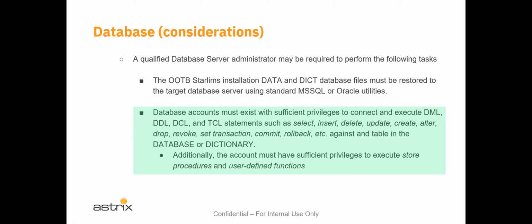As you encounter additional customizations of STARLIMS, there are instances where you're going to need to go into the designer from where you will access the database and the dictionary records. And you might need to create additional fields, additional indexes, new tables altogether to handle new functionality. So you will have the necessity to go in there and make additional table changes as necessary within the database and dictionary.